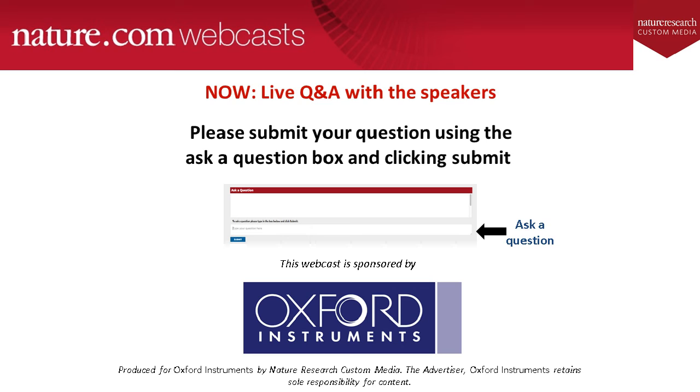Excellent. Thanks, Erin. Next question asks, is it possible to fix cells over gold-coated glass slides for EDX and SEM analysis? Yeah, I'll answer this one. Yes, it is possible.